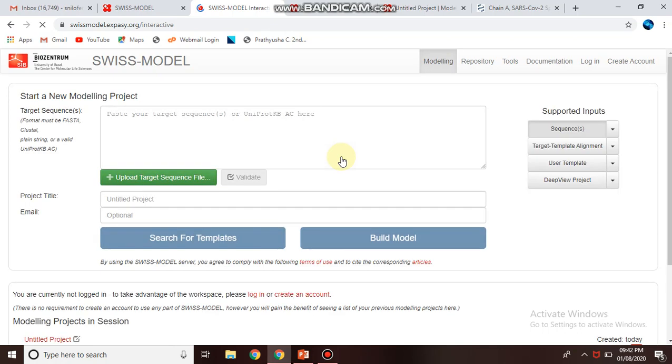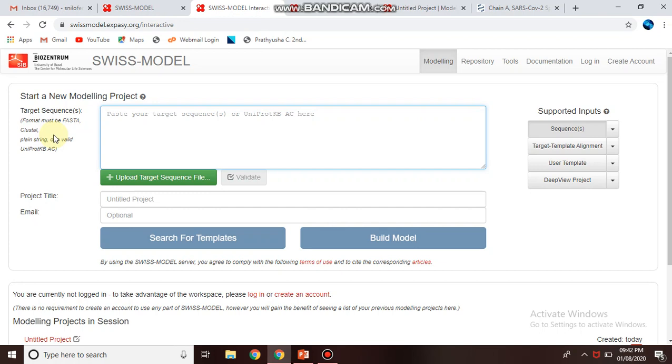Once you click Start Modeling, it will ask you for the target sequence in FASTA format or cluster format. You can download this protein structure from UniProt KB database. Here you can paste or upload your FASTA sequence.